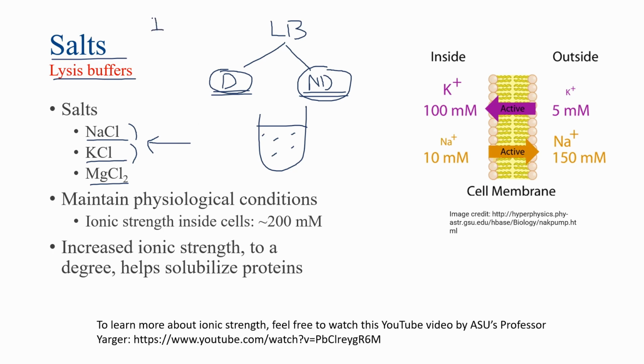And I'll talk about ionic strength in a bit. Now, basically, ionic strength is a measure of the concentration of ions inside the cell. So we know that if we take a look at a cell in physiological conditions, say a cell within the human body, the cell regulates the concentration of different ions inside the cell as well as outside the cell. The ions within the cell and outside the cell are regulated to have particular concentrations.